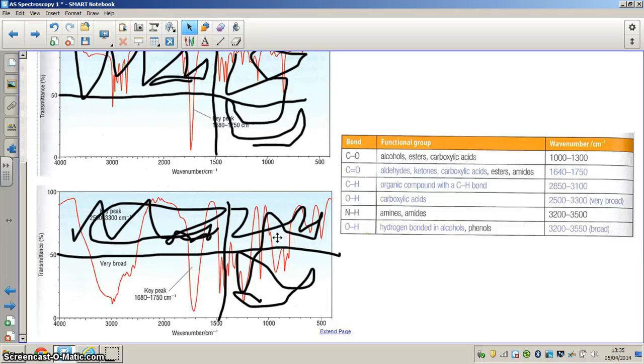And that's IR spectrum basically in a nutshell. I stress the point that I made at the start. You do not really need to know anything about the functionality of the IR machine. You just need to know the principles of how it works.